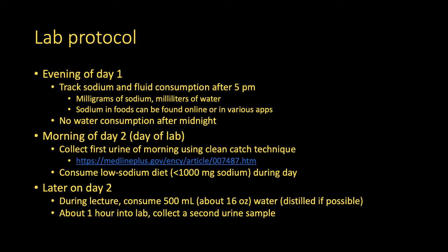But keep track of everything you eat between 5 p.m. and midnight. And after midnight, try not to eat anything else, and especially don't drink any water after midnight that night. The next morning, the first urine of the morning should be collected using the clean catch technique.